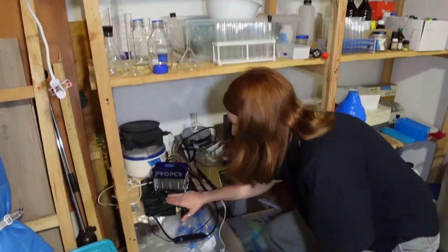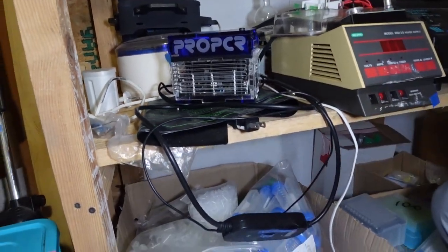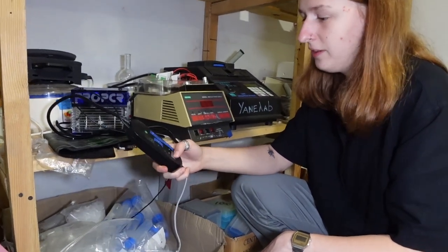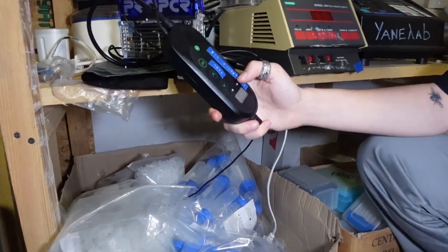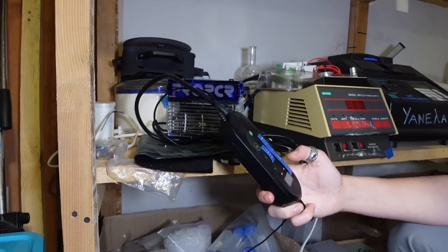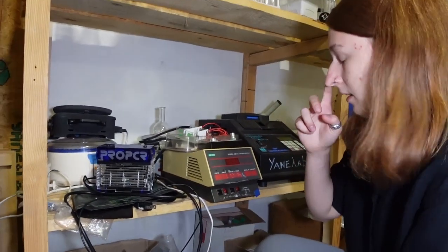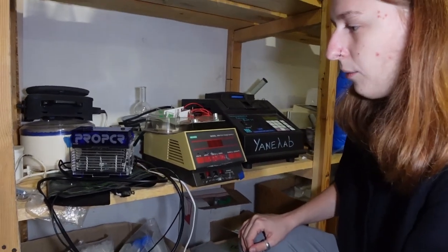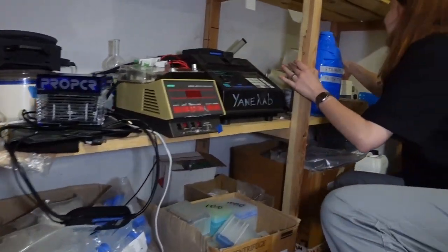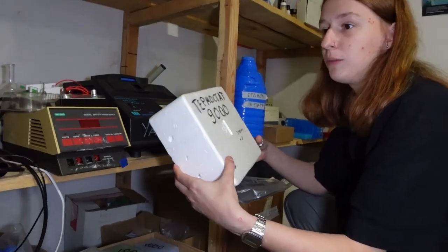I have a heating mat. I used this to culture human cells before I got the chicken incubator. It's basically a little mat and you can control the temperature. It's pretty neat, you can use it instead of any other incubators. Pretty cheap, you can get it anywhere on Amazon or eBay. I used a styrofoam case to put it on top so it would keep the temperature.